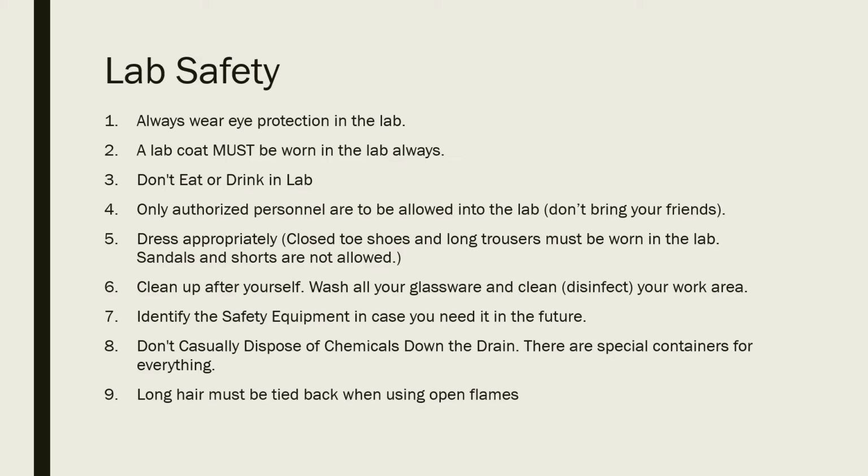Here's a key thing that's always important when you enter a lab. Make sure to know where the safety equipment is. You never know when you walk into a lab and then something happens. It's always good to know exactly where all the safety equipment usually is.